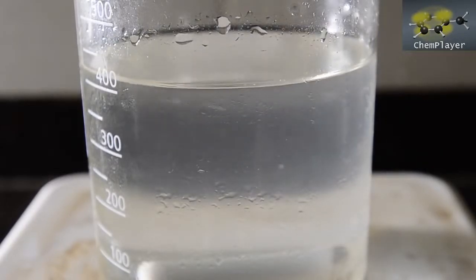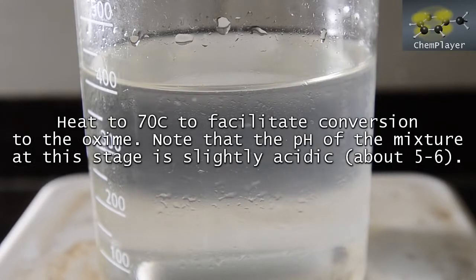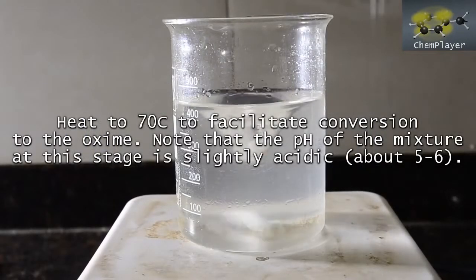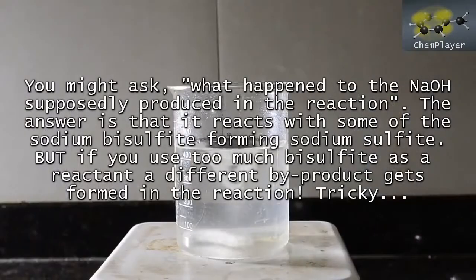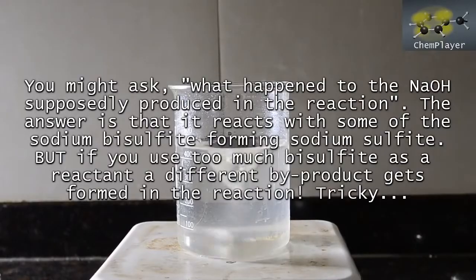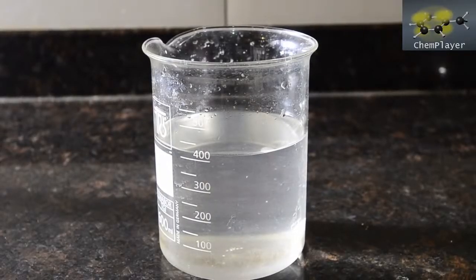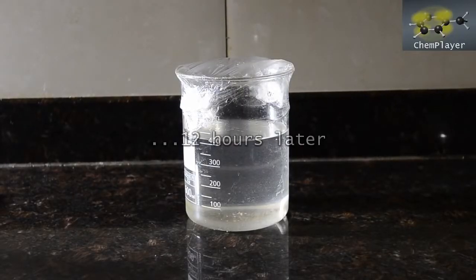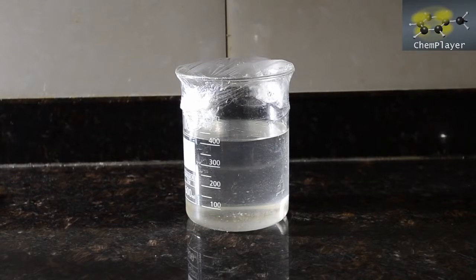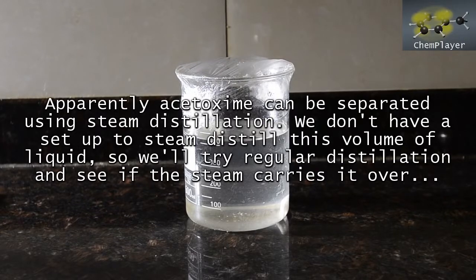And now we're going to heat to 70 degrees C in order to allow the conversion to take place. Then we allow the mixture to cool slowly, and leave overnight at room temperature. Here we go. Apparently the best way to separate the oxime is by steam distilling it, so we're going to try to do this just by distilling the mixture directly and seeing if it can come over with the water.